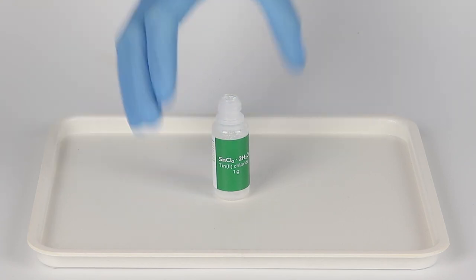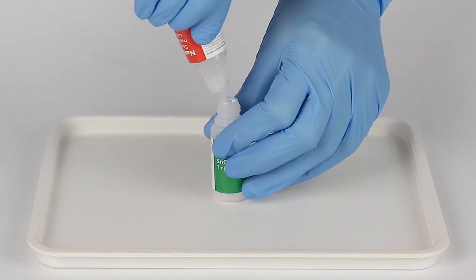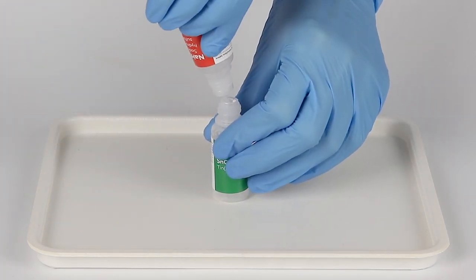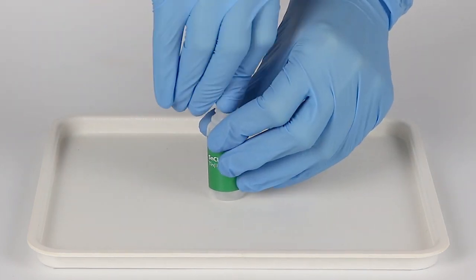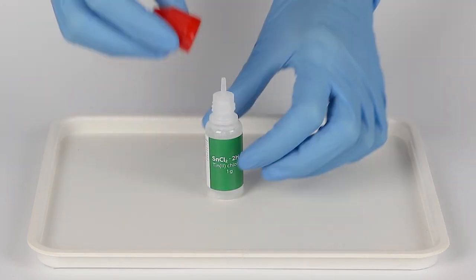Open the bottle of tin chloride and pour one bottle of sodium hydrogen sulfate solution into it. Securely insert the tip and close the bottle using the red cap.